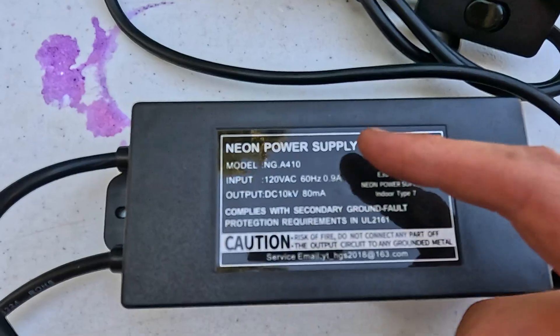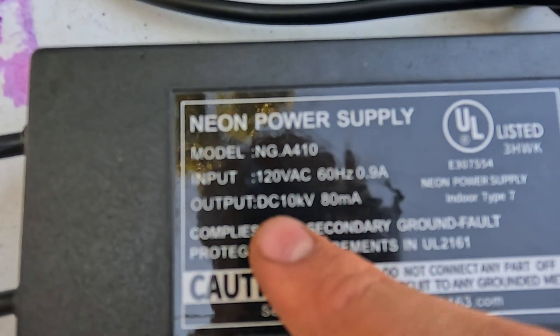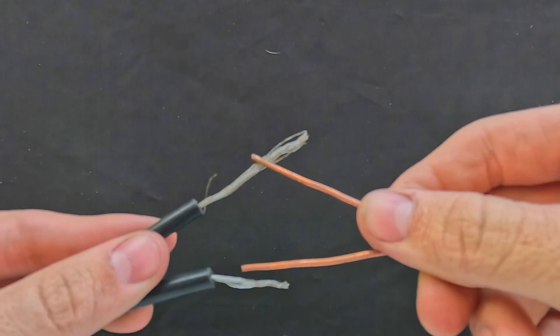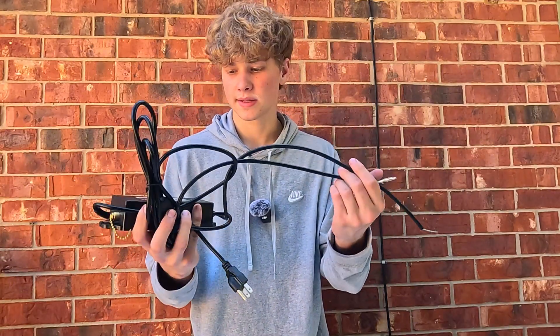So because our power bank doesn't work, we're going to need something that produces a lot of electricity that can still plug into your wall, which brings me to this neon power supply. I also don't know if 10k means 10,000 volts, but maybe that's the volts. It plugs into our walls and conveniently has these two points at the end which we're going to use to connect to our wires. This looks like the perfect example of what we need, so let's go try it out.